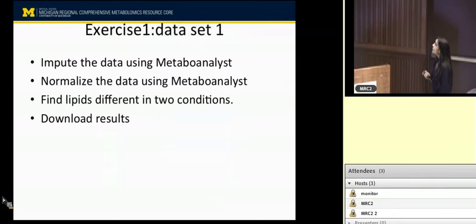So with this, what I think is you can go ahead and start with this exercise first with this data set, just to get an idea, if you're not familiar with metabolomics, of where to upload the file and so on.